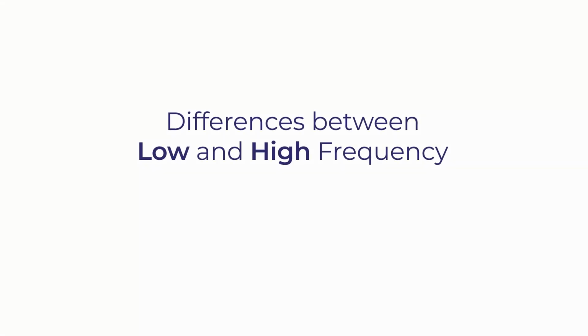Hi, I'm Paul Blanton, President of EEC, and today we're going to talk a little bit about how active and passive vibration isolation systems work together to provide a total vibration isolation solution for your instrument.